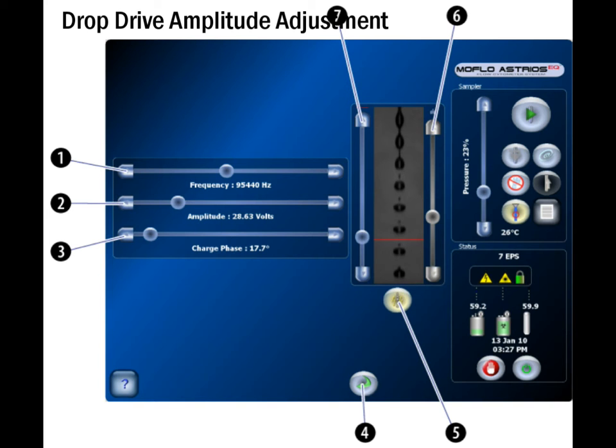To reduce the noise population, the user could adjust the drop drive amplitude to reduce the noise population in the forward scatter versus side scatter channels. It is not suggested to adjust the frequency, but the amplitude may be adjusted lower as long as the drop formation remains stable and the customer executes amplitude changes prior to running IntelliSort 2.